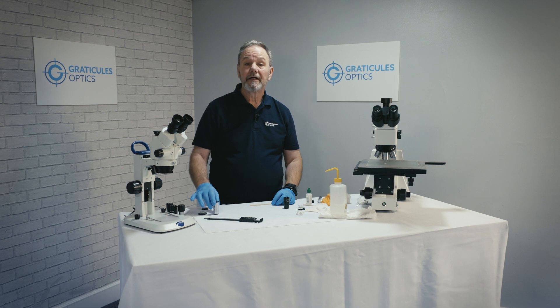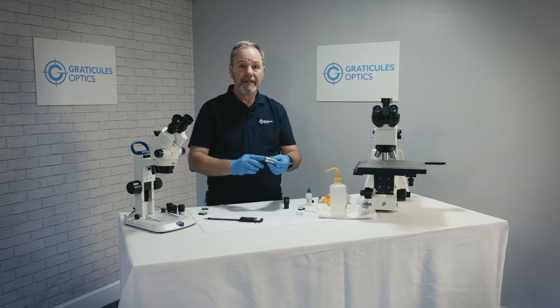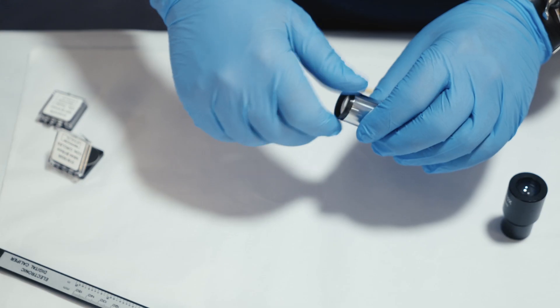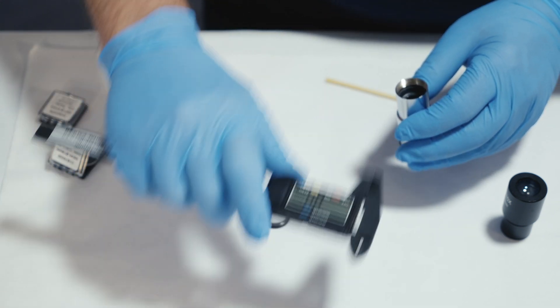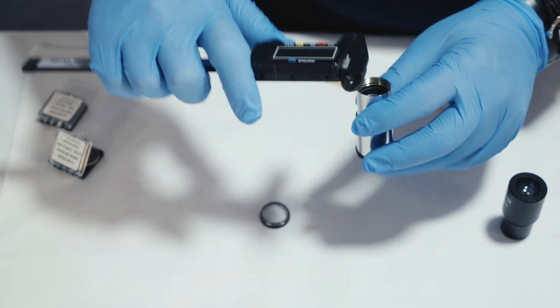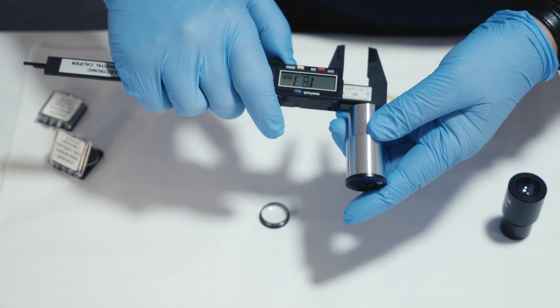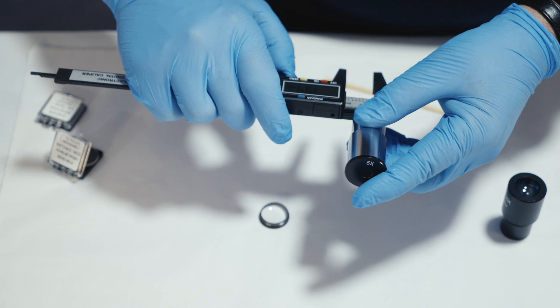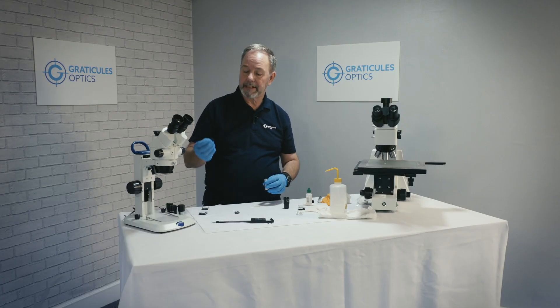This is our Huygenian eyepiece, which is the more complicated of the two. It has a lens at the top and at the bottom. This is the field lens, which I can remove. We need to measure the mount, and we're going to do that using our micrometer. This one measures 19 millimeters, so we know this 19 millimeter reticle will fit.